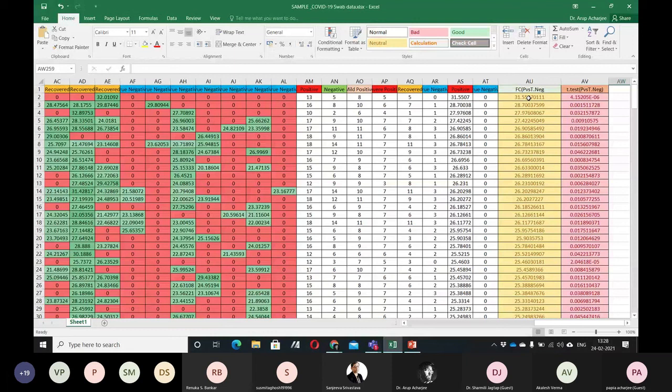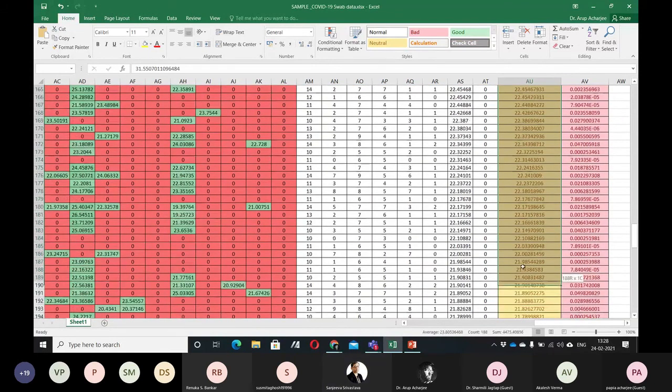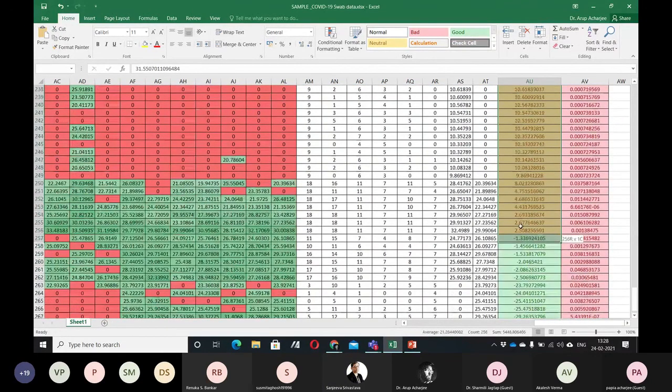But once you have your experimental data, which is your own data, please do follow these steps. You have to do the data cleanup pretty properly, because if you throw in any wrong data set, the results will come out all wrong. So these are the genes that were upregulated, and these were the genes that were downregulated, the ones highlighted in green.